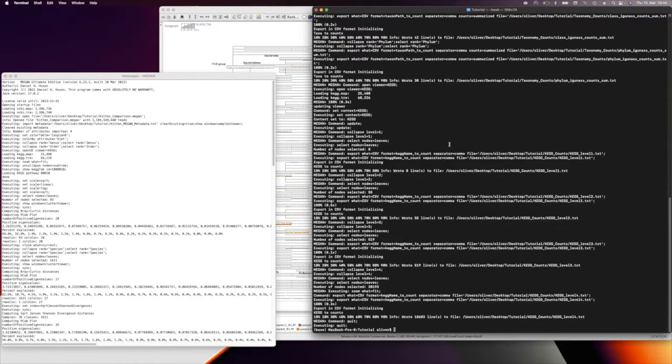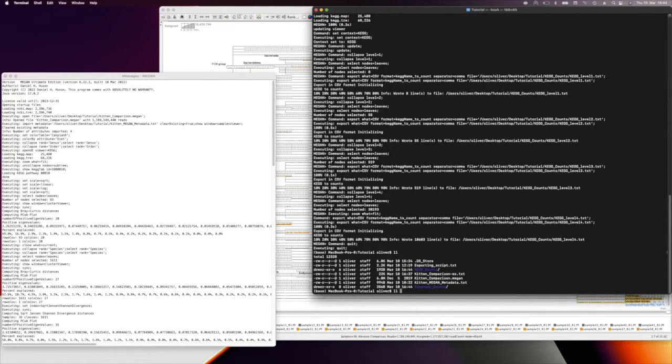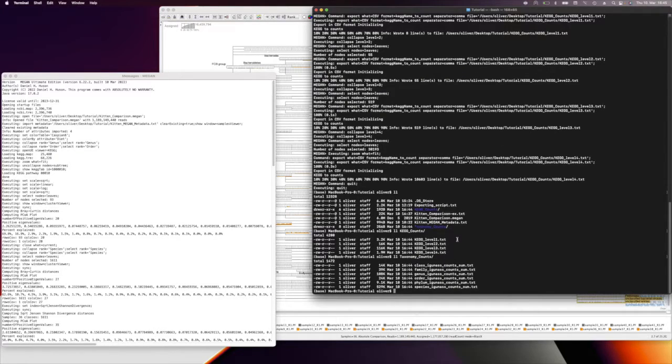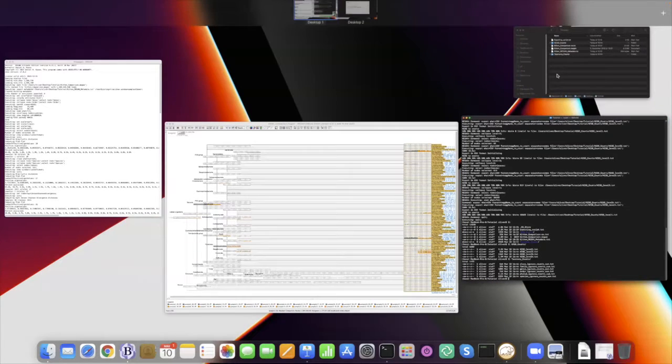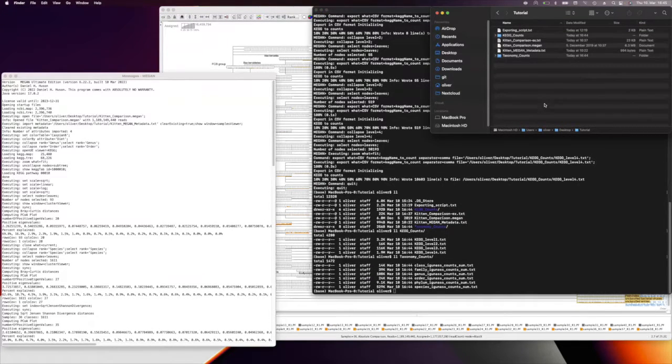And what we are going to do now is have a quick look if this worked. So we're going to look at the KEGG folder. Yeah, we've got the KEGG counts, and we're going to look at the taxonomy counts, and we've got them as well. So with just executing this quick script, we've generated those 10 text files. And again, if we want to do this for the next data set, we can launch the exact same commands, and it's not a problem, and it's all reproducible.